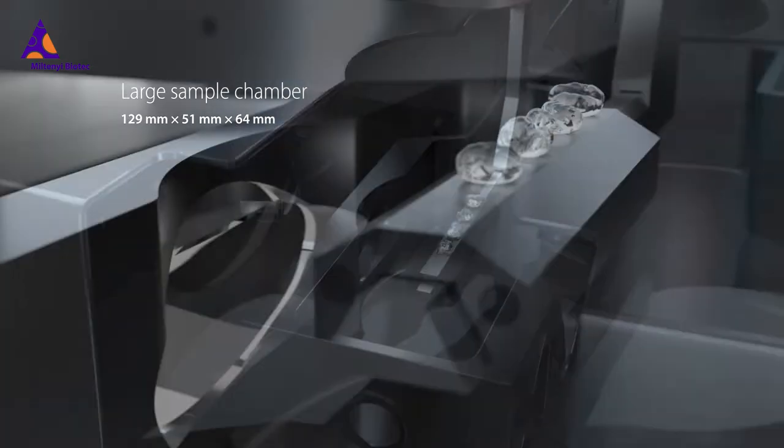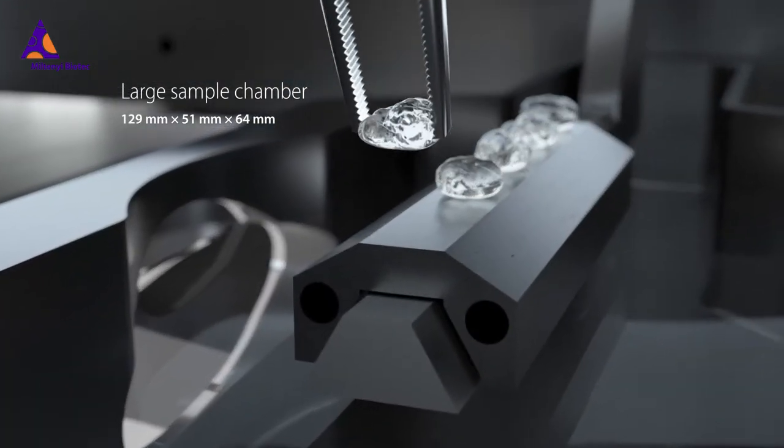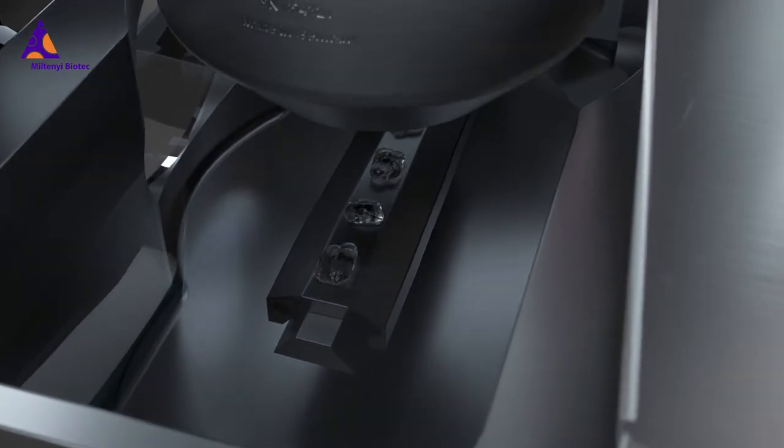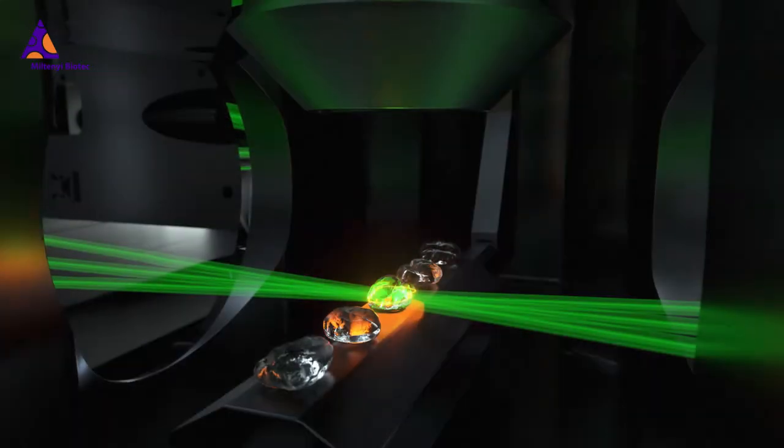The sample chamber can host an entire cleared mouse model or allows automated imaging of multiple samples. Samples can then be imaged sequentially.